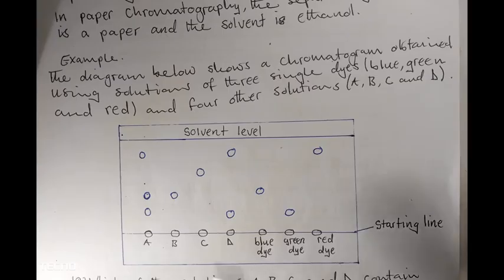Even these spots need to be small, so that they are able to move in a normal way. Because if you put a big ink spot here and there, this ink and this ink can combine and also affect the result. So there are certain things that should be taken into consideration.